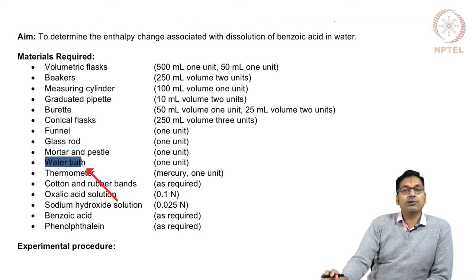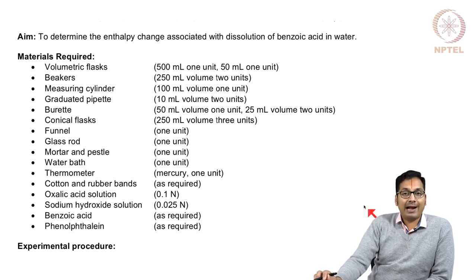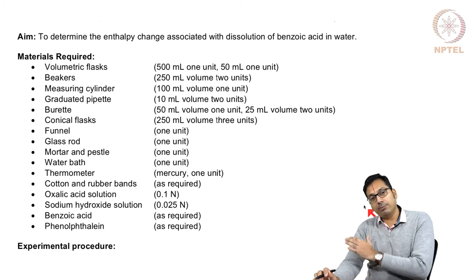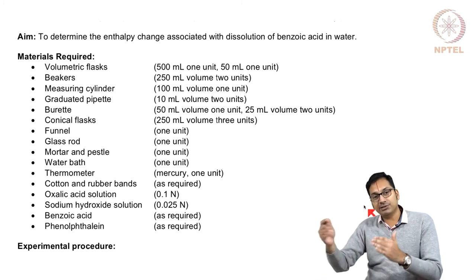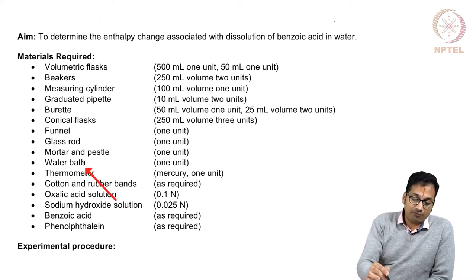And a water bath. If you remember the last experiment, I told you to make a note of the temperature so as to determine the density of water at that given temperature. This is one experiment where we will be doing the same equilibrium measurement but as a function of temperature, meaning that you will keep changing the temperature to measure something. For that reason, you have to maintain the temperature at which you want to measure, and the water bath is going to be extremely useful.